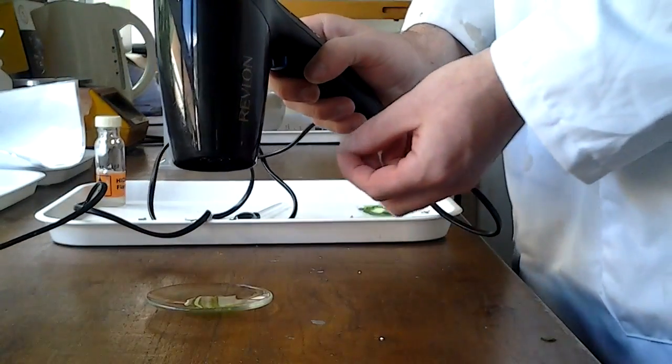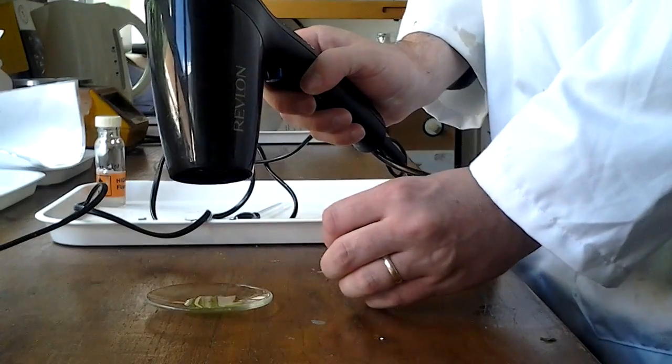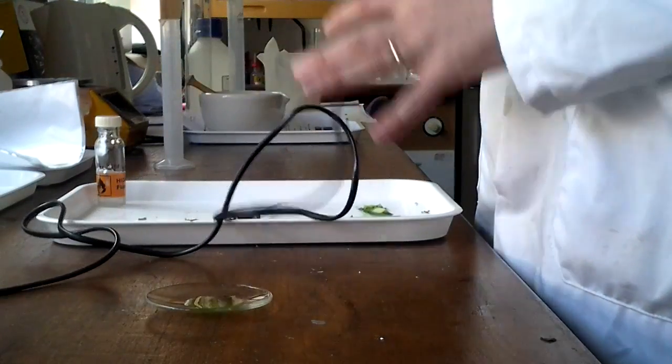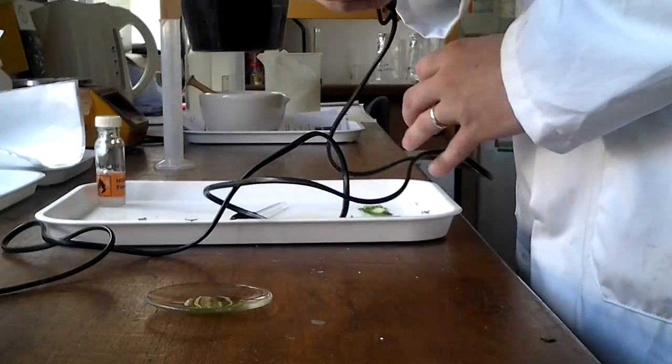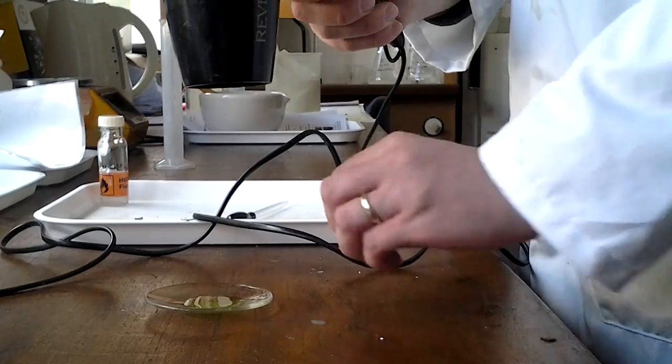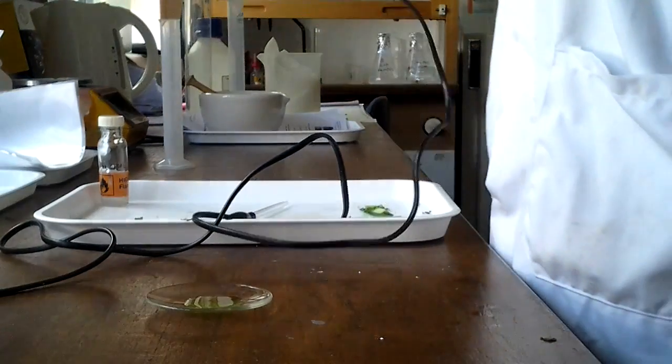But if you do that, you run the risk of your green liquid that you've worked so hard to get jumping out all over the desk. So it's better to start off up high, gradually bring it down until you're pretty sure that you're getting maximum airflow, but you're not in any danger of blowing the liquid out of the watch glass.